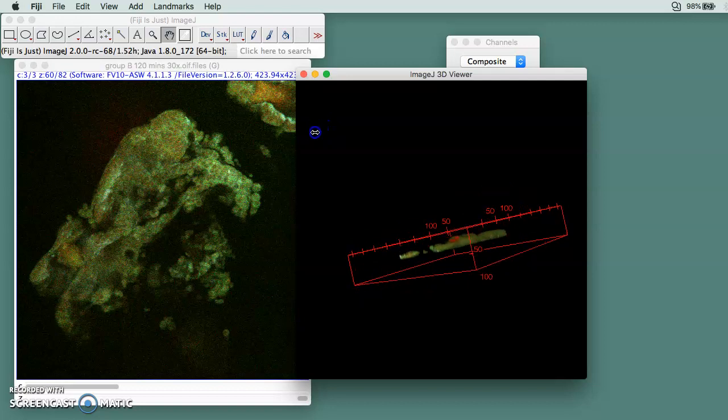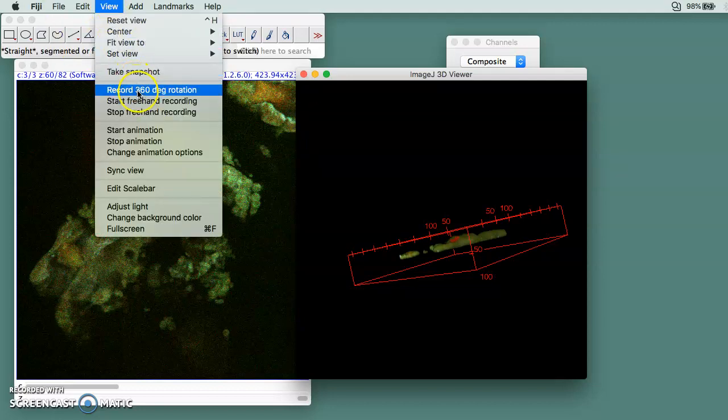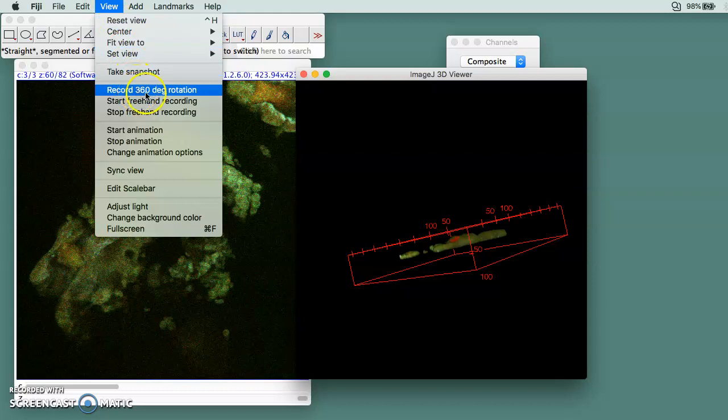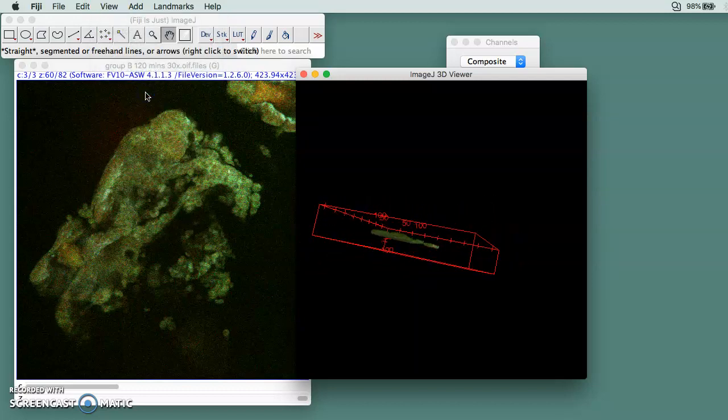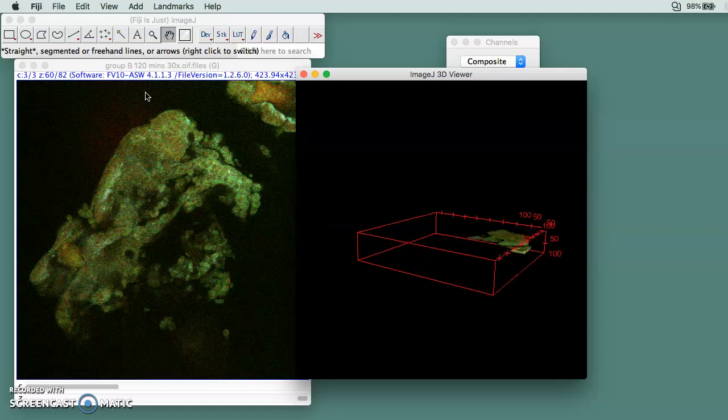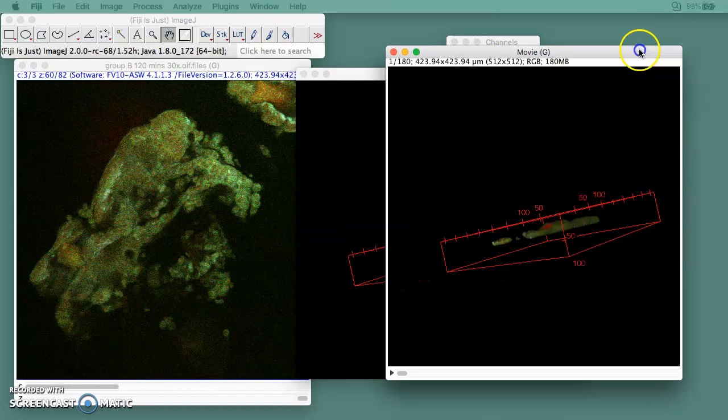If you want to save it as a video, you go to View and then you do Record 360 Degree Rotation, and it's going to create a movie.